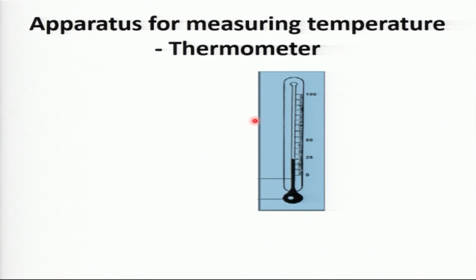Or you may be doing an exam here and other people doing it in another country where the temperature is different. So in the exam, normally they try to indicate the temperature you are working in, because the temperature goes hand in hand with the time of completing the reaction.